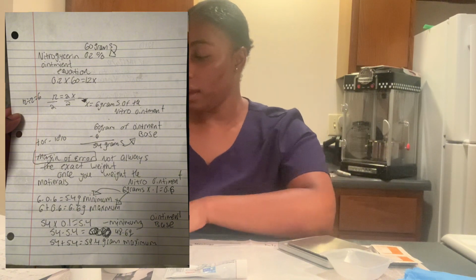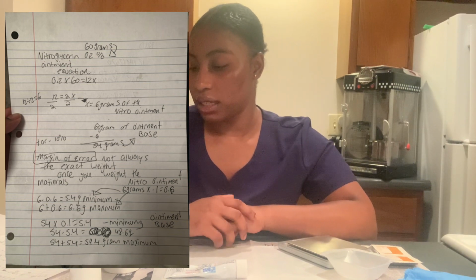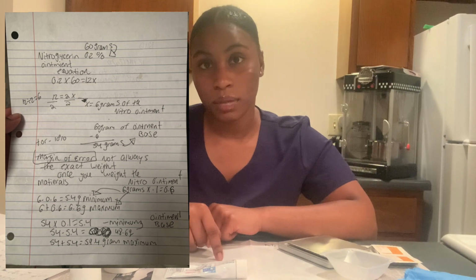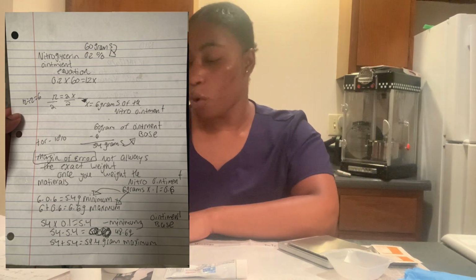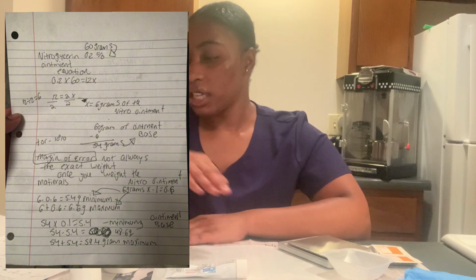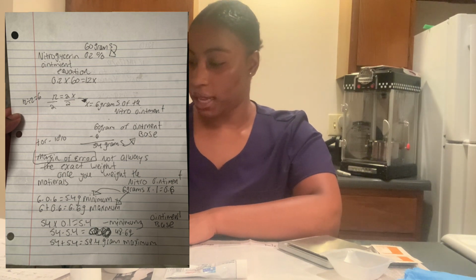take the 6 minus 0.6, which equals 5.4 grams, which is our minimum allowable weight. And how I got the 0.6 is that we take the 6 grams from the nitroglycerin ointment and multiply that by 0.1, which equals 0.6.